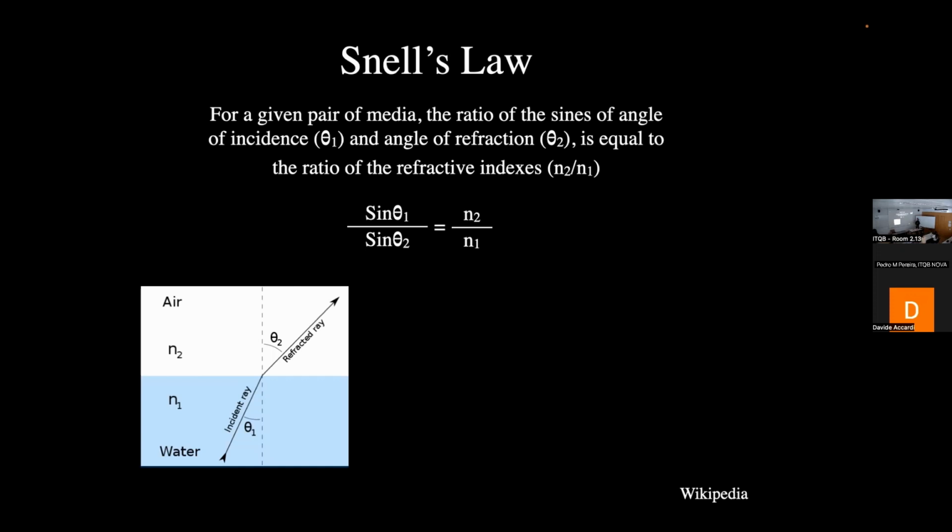This is the description, it's not the motivation. Okay, so the mathematical description. And then, of course, you can do all the calculations to solve the case. By the way, all the slides that you will see from now on, all the bendings of light and all the animations, were done with the calculated angles of refraction. I had lots of time doing that, very much, but it was very cool. It's true. So they are not made up, they are really calculated.